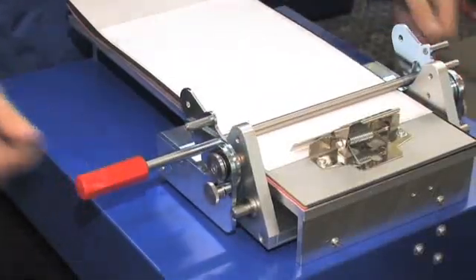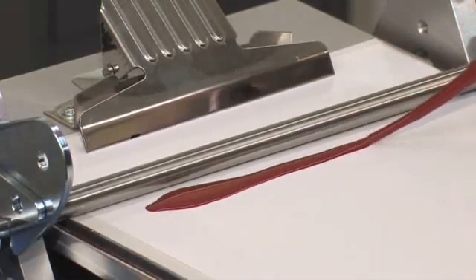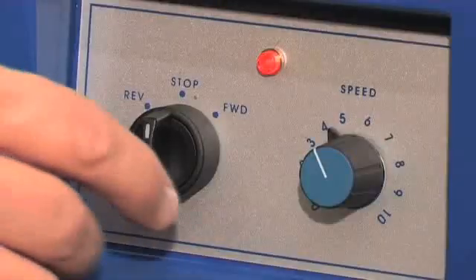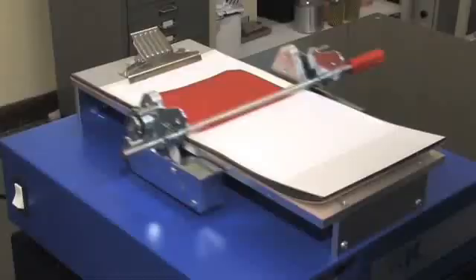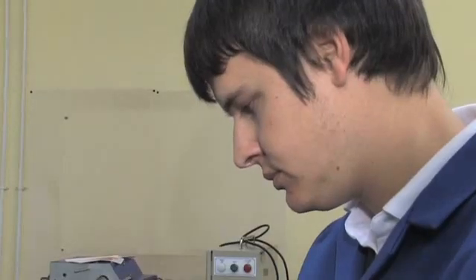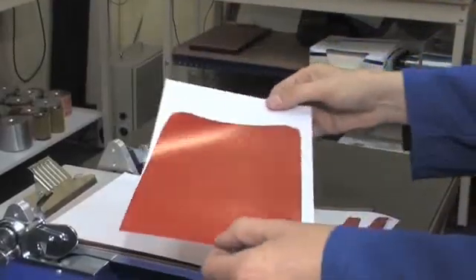The bar inserted, the substrate down, the drawdown process is straightforward. A single switch and you have quick and perfect drawdown, ideal for quality control across a large spectrum of industries, from packaging to textiles.